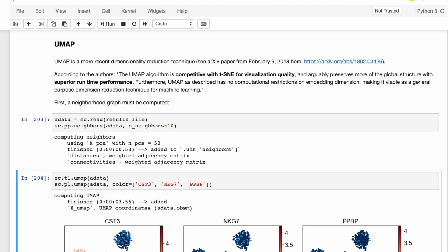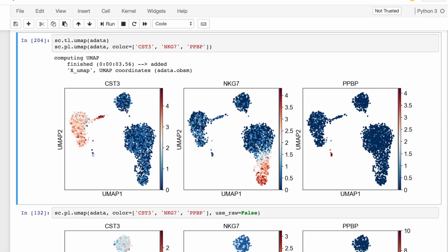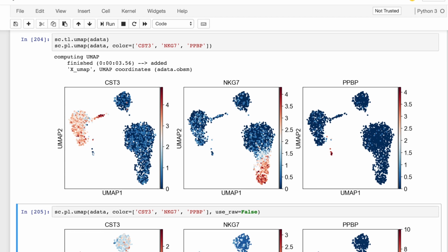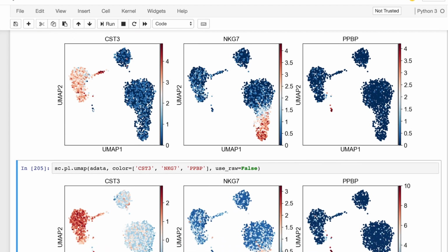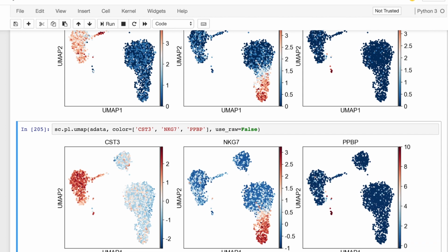As you can see, I did not speed the video up by 20x this time. In fact, I just slowed it down a little bit to be able to visualize everything. And again, there are similar clusters as the t-SNE and PCA showed for the genes that I chose to show here, the 3 genes recommended by Seurat and ScanPy.